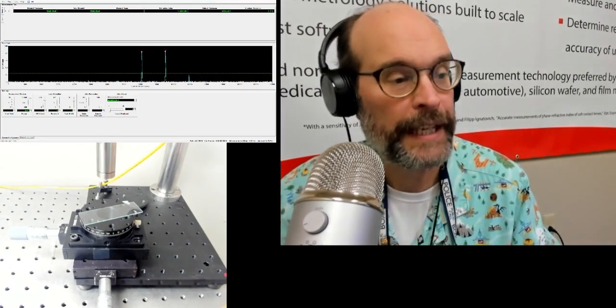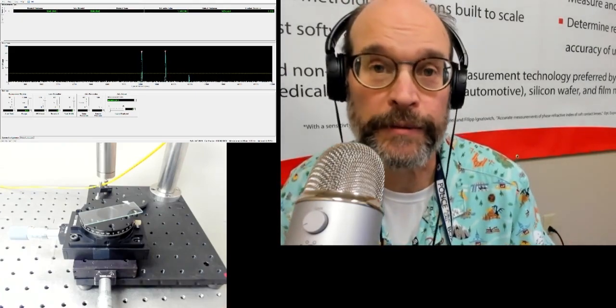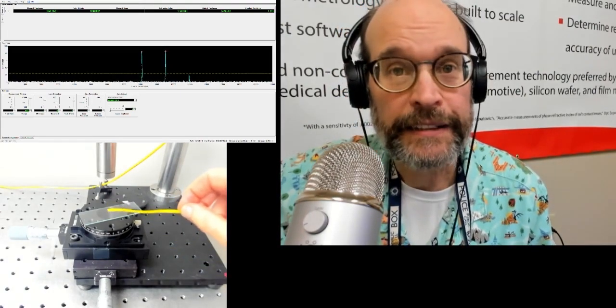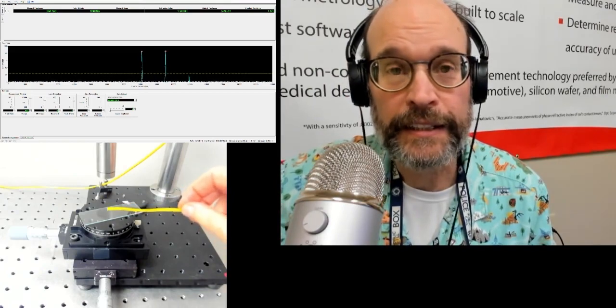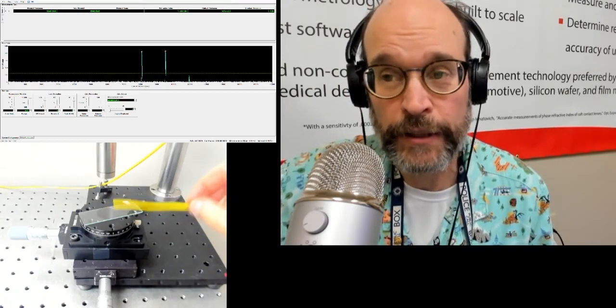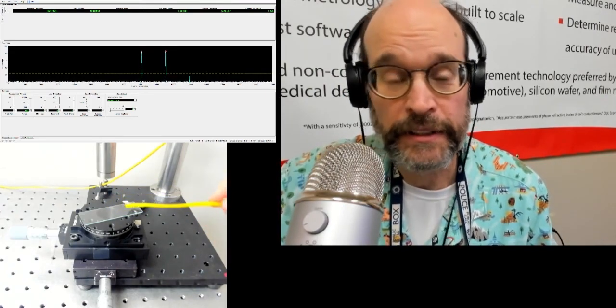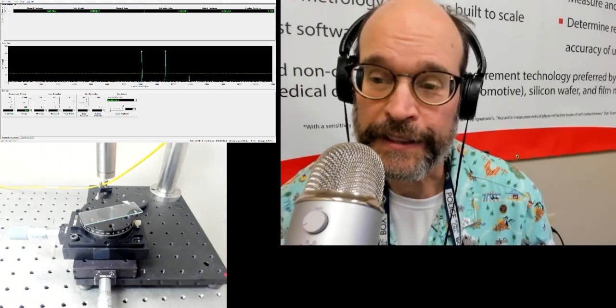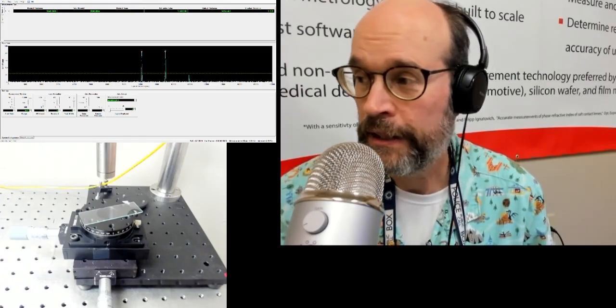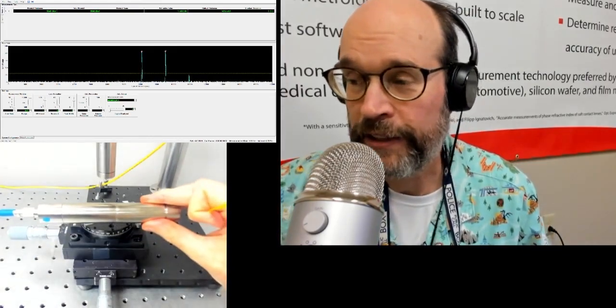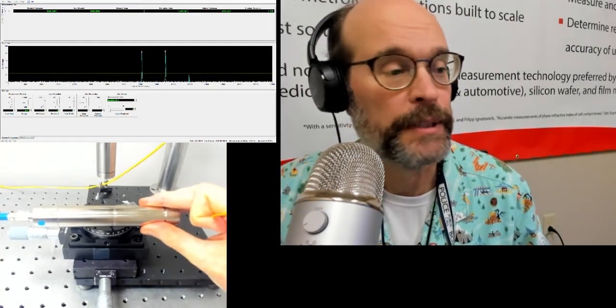So what you have to start with, what's important with a verification probe, is really a measurement. First off, I am measuring a slide. This slide is very critical. We need to know the thickness of it to within a micron. And to be confident that we're doing that accurately, we're going to employ a verification probe.